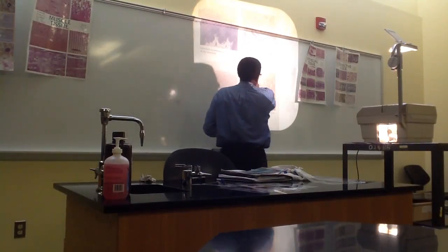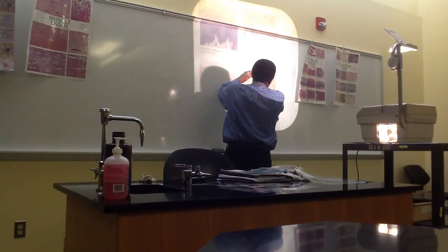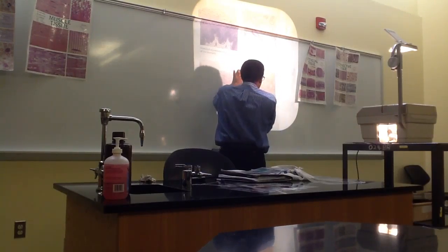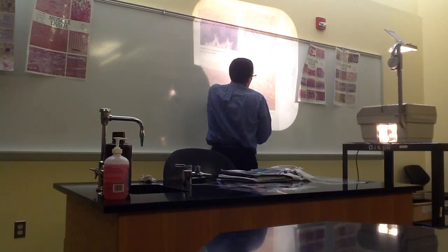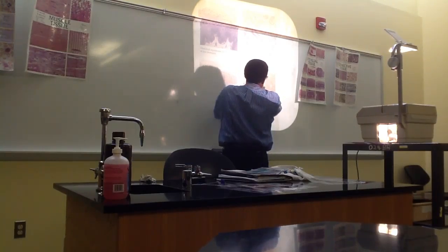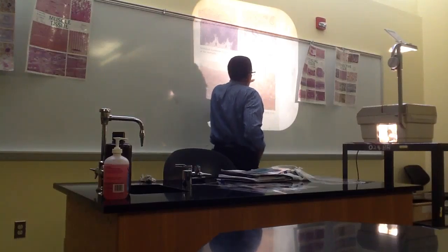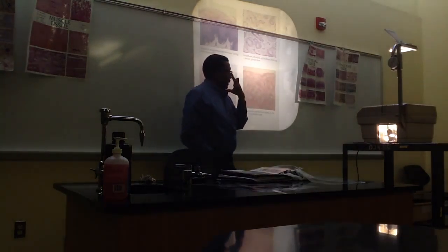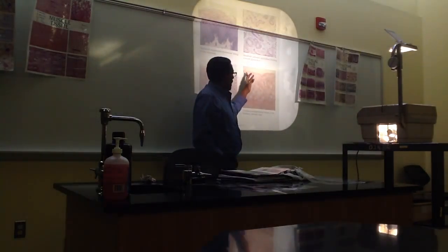That's why it looks like the cytoplasm looks real thick here, because this tissue will stretch. So when the bladder fills up with urine, but yet you don't want these cells to tear apart from each other, it looks like they have a tougher membrane up top. And to me, that's going to be one of the main identifying characteristics of transitional epithelium.